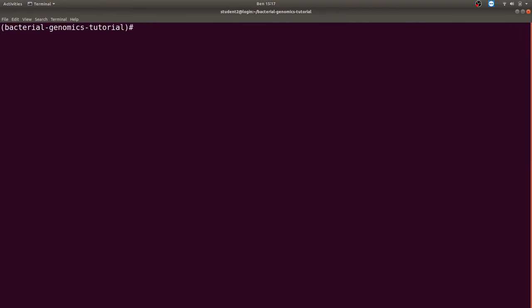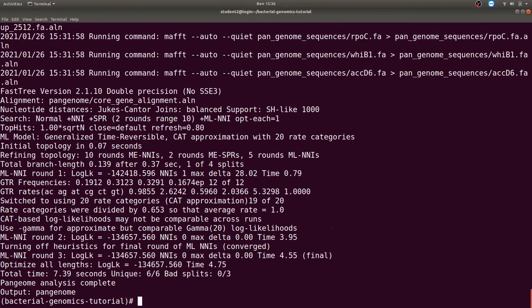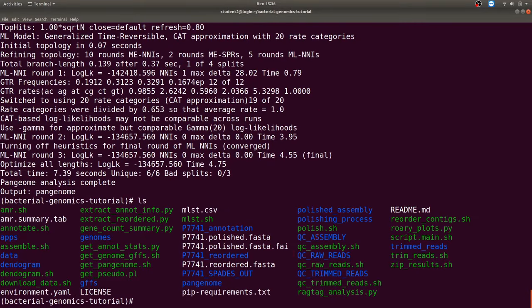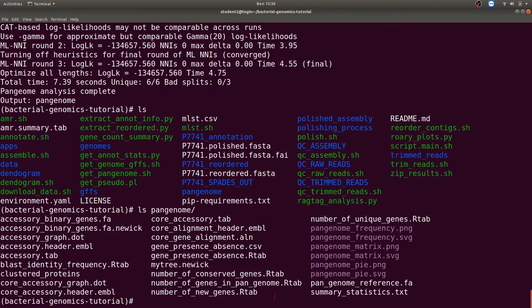All GFF files have been generated and confirmed. The next step is to perform the pangenome analysis with Roary using the script 'get_pangenome.sh'. The pangenome analysis is now complete and can be found in the pangenome folder, which contains several image files. We'll discuss those images shortly. The pangenome generates gene information for various isolates, which can also be extracted into a more visually appealing form.